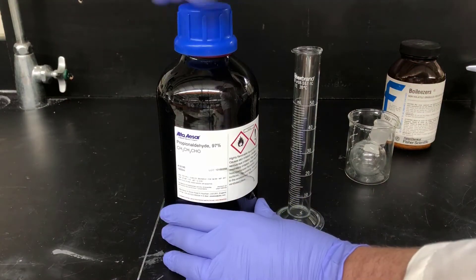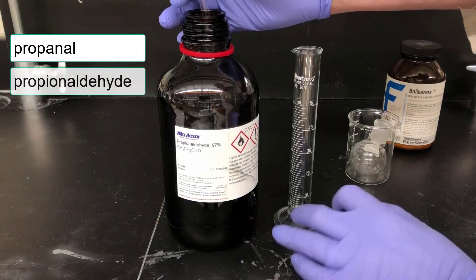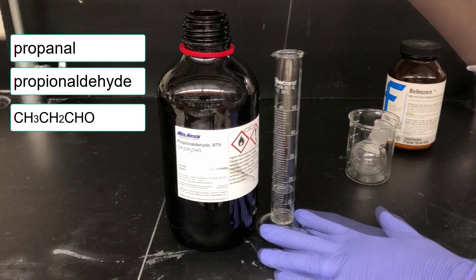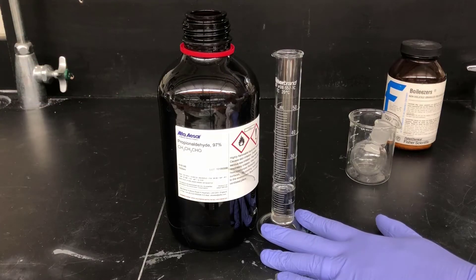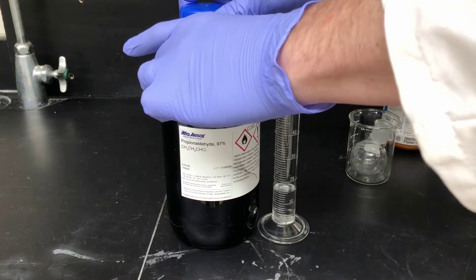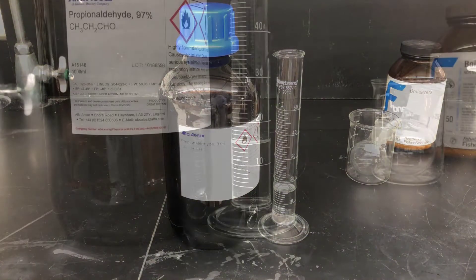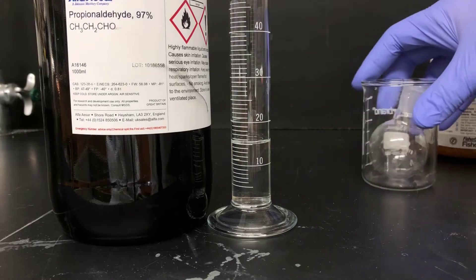I'll start off by measuring out 15 milliliters of propanal. This is also known as propionaldehyde, and it's a 3-carbon aldehyde that'll be the starting material for this week's experiment. The graduated cylinder I'm using here has graduations every 1 milliliter, so it's possible to estimate out to the next digit. This will be 15.0 milliliters of propanal measured out here.